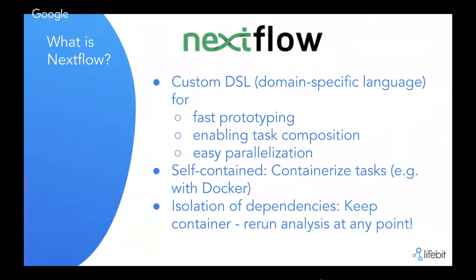So I guess that's what makes it extremely easy for us, because, as you said, if you suddenly receive something and need to start working with something as complex as, in this case, DeepVariant, you need to be able to plug in any kind of software that you want. Nextflow allows you to plug in any piece of code, any container, and compose even a large and complex pipeline in a really easy way, without having to learn anything new, just reusing any piece of software that you have available. And I think that's what we ended up doing with DeepVariant in this case.